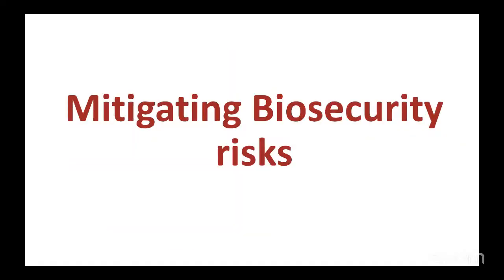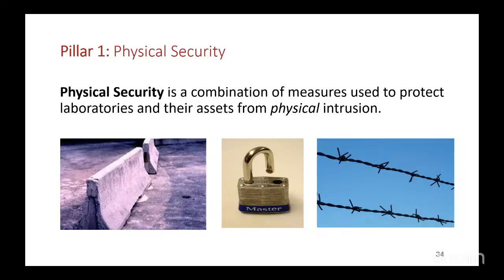Biosecurity. So now, when we talk about physical security, it is a combination of measures used to protect laboratories and their assets from physical what? Intrusion. You can see all these are barriers. You see barbed wire, keys. These are part of our physical security.